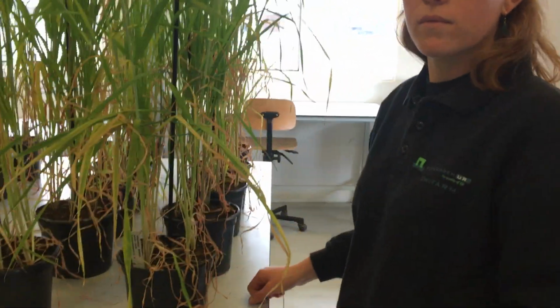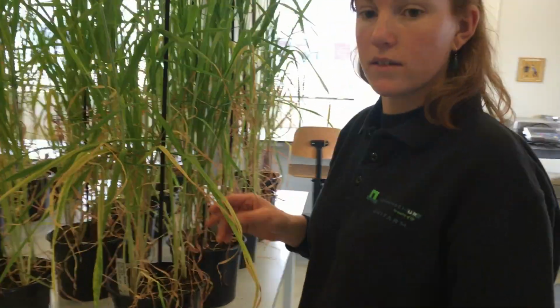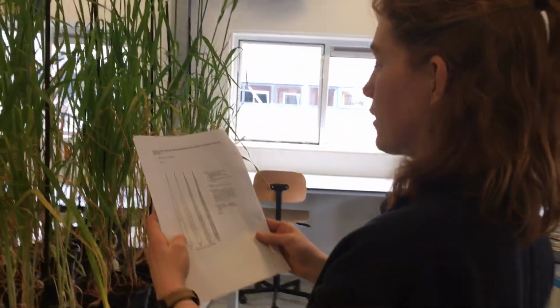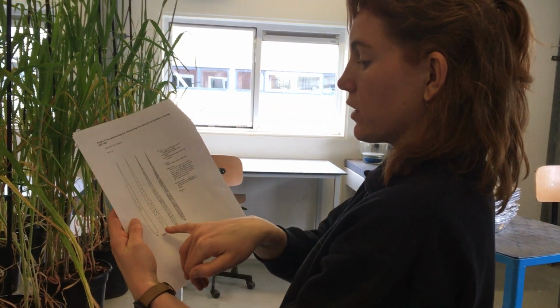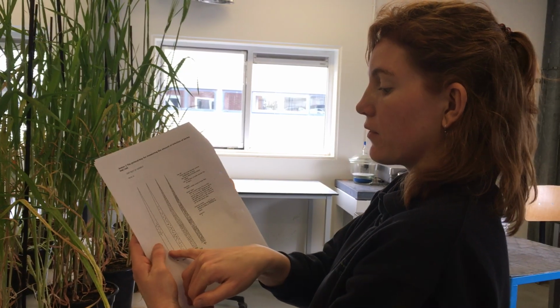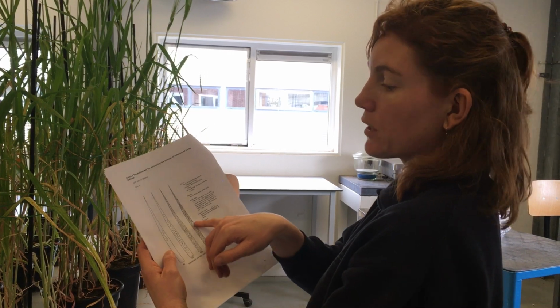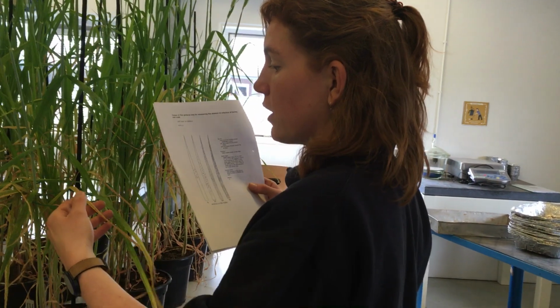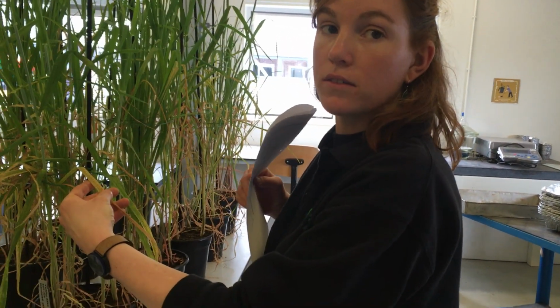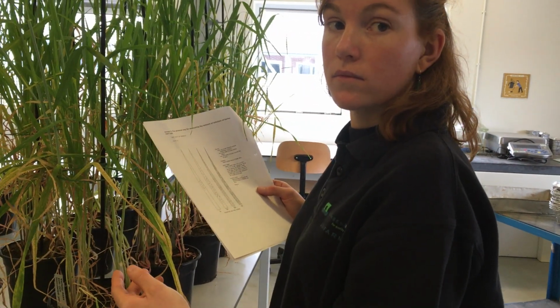With the inoculated one, we need to score the infection. How are you going to do that? I have a handy score sheet here. It shows different levels of infection. So here 4% of the leaf is inoculated, is sick, and here 20, 50, and 90%. So I can use this as an indication to try and figure out how bad the infection is. Okay, you score each plant, but you take an average of the 5 plants.